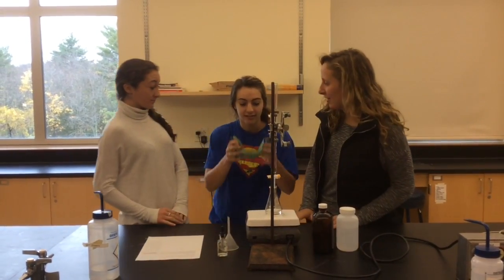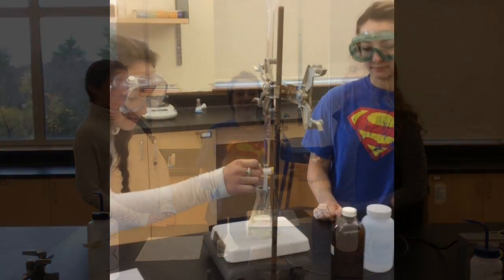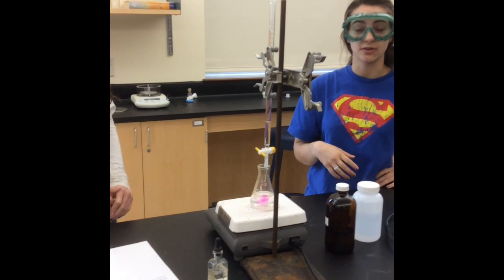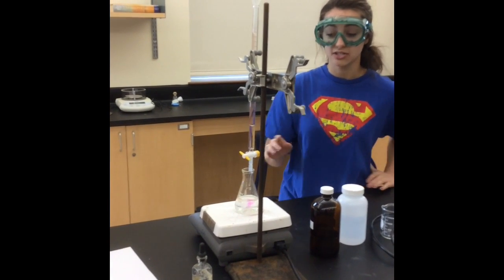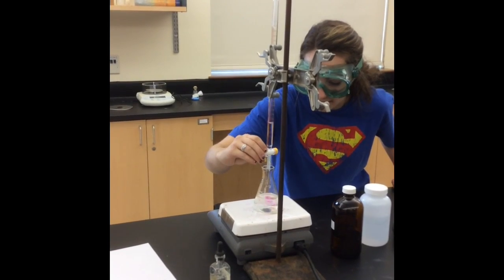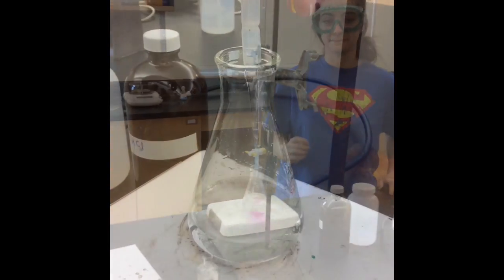Guys, hold on. Goggles. Slow down. When you see the pink take a longer time to disappear, that's when you know that your titration is almost done. So always remember to go drop by drop, like you see here. Leave your work area clean.